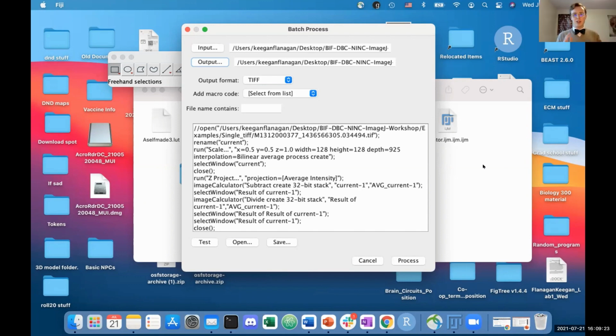Are there any more questions before we start kind of wrapping up the workshop? Yeah, I just had a second question, sorry, real quick. When I was trying to do the recording of the macros, and I went on to the brightness and contrast step with the small histogram, it said that I didn't have an image, but then I think someone mentioned this in the chat earlier, but I wasn't really following along.